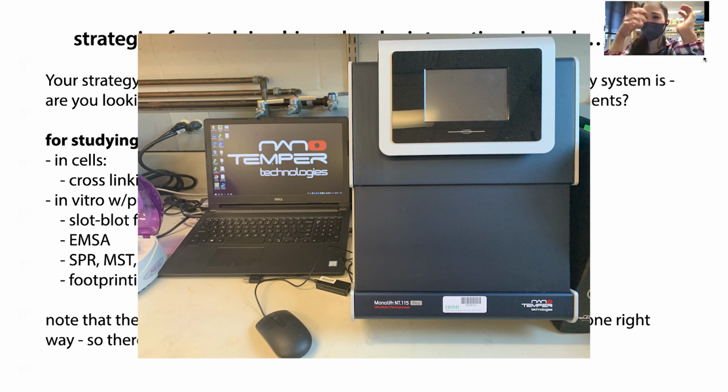It's kind of complicated, and I don't know all the details, but the idea is that if these are bound, it's going to change the fluorescent properties. This influences the signal, and so you can get information about the binding that way. So these are just different techniques.